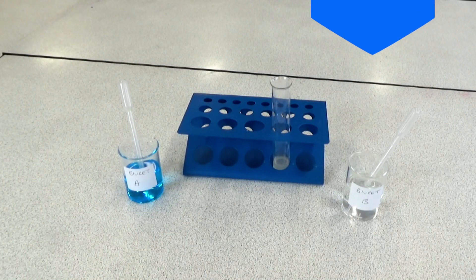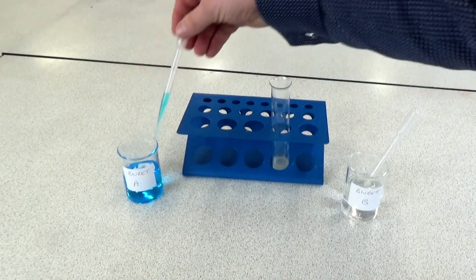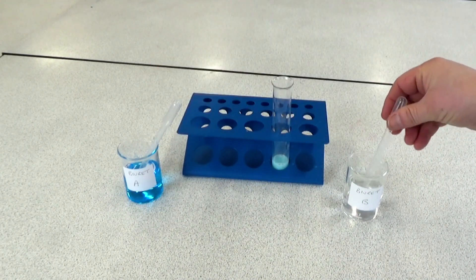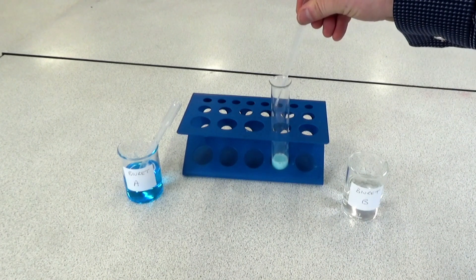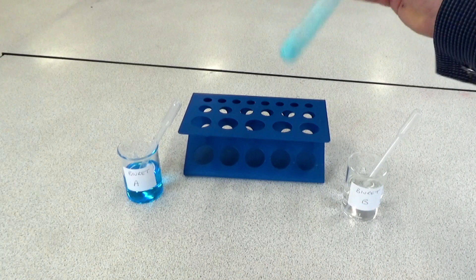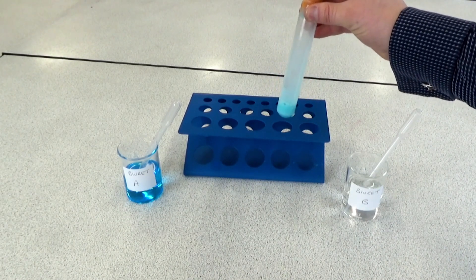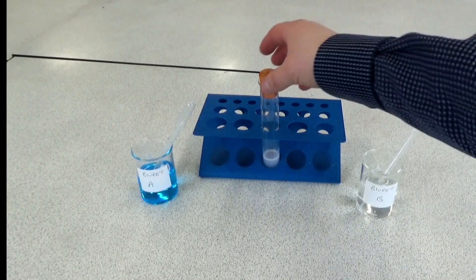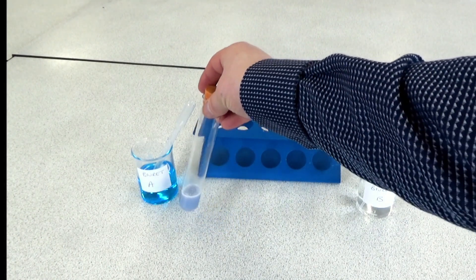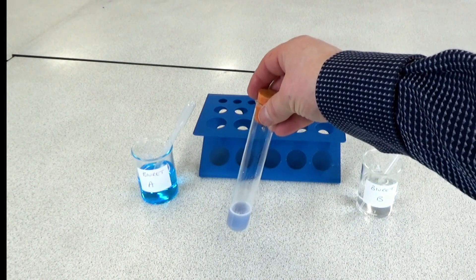The students can then carry out the test for protein. This is a two-step method: we add one milliliter of Biuret solution A, mix that in, and then add one milliliter of Biuret B. We then shake it up and check for a colour change. We can see that the Biuret solution has taken on more of a purple colour compared to the blue that it started out as, which indicates that this particular food contains protein.